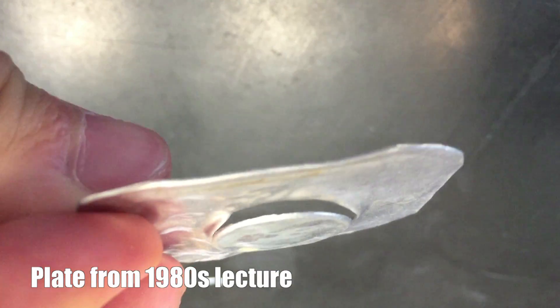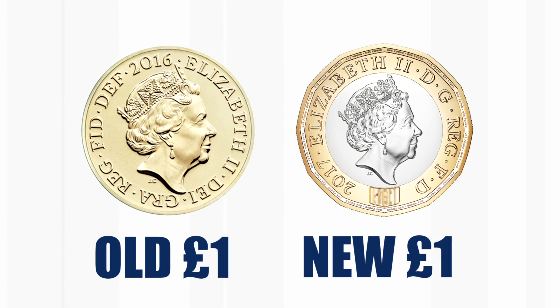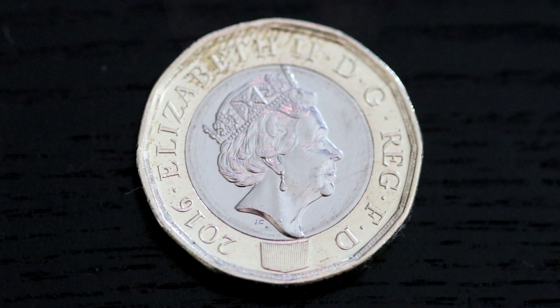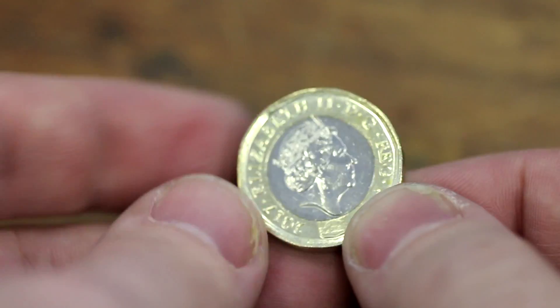With a new British pound coin, which has 12 sides, it seemed a real opportunity to try the experiment with a new pound coin. But there's a catch — you can see it's made of two pieces: a brass-coloured ring and a silver centre. The coins we've used till now in this experiment have always been solid coins made of the same material all the way across.